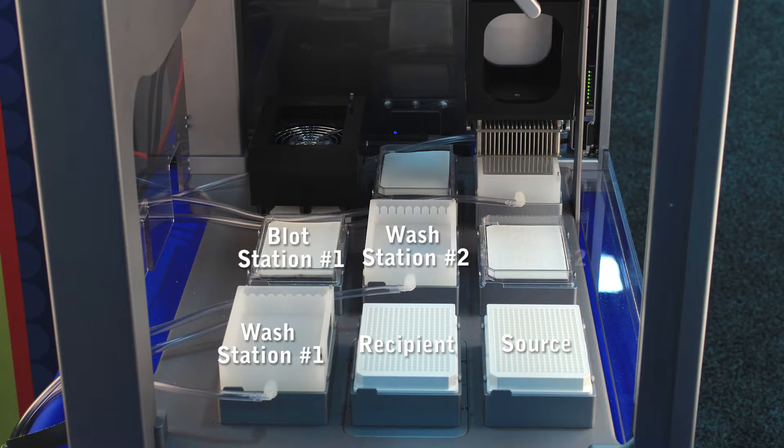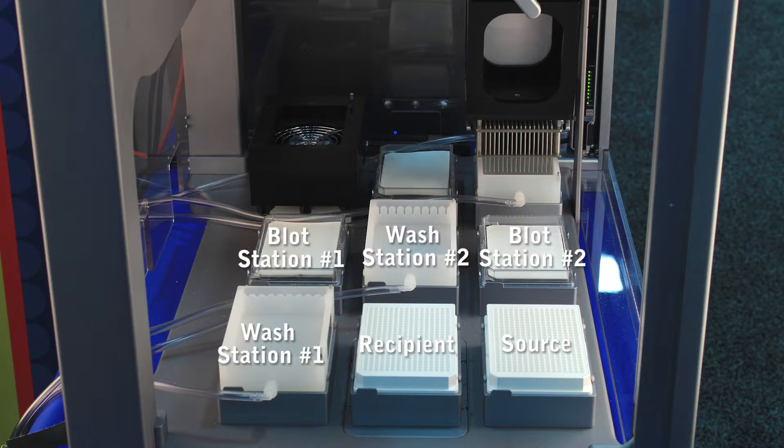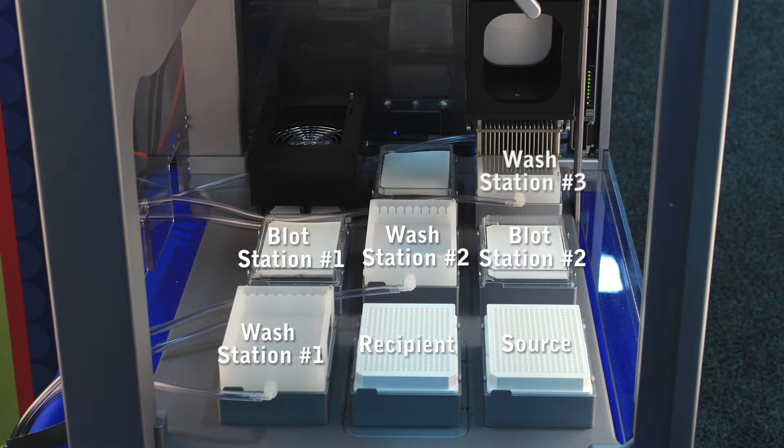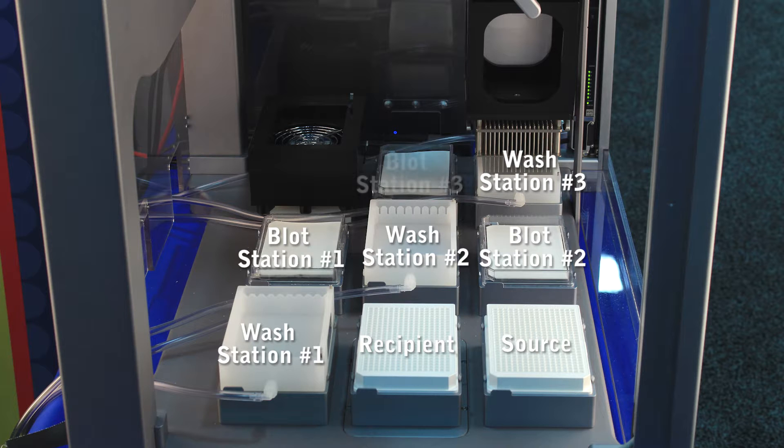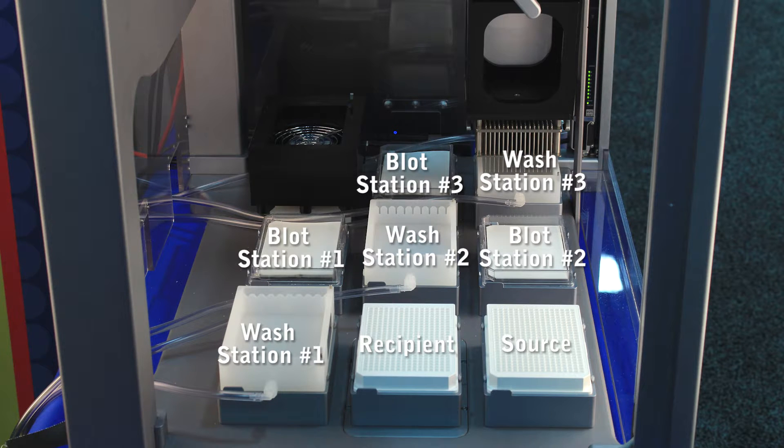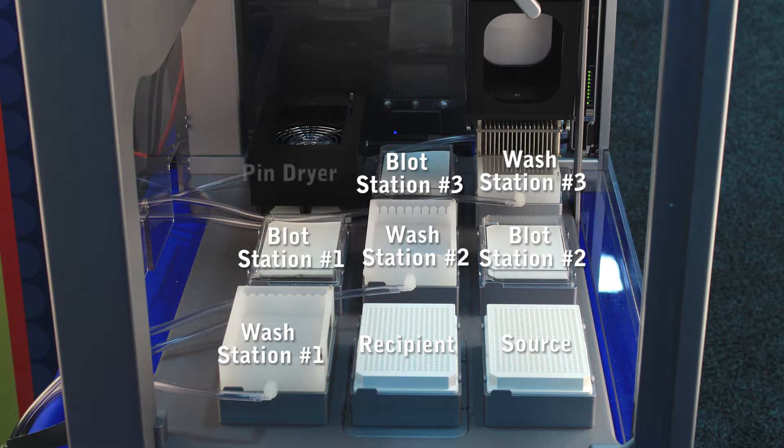Another blotting station, wash station number three filled with alcohol, another blotting station, and a pin tool dryer.